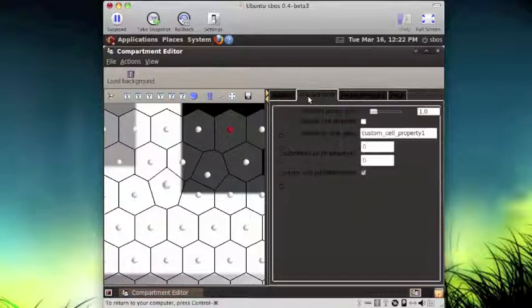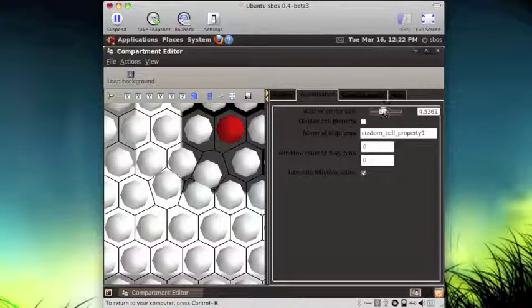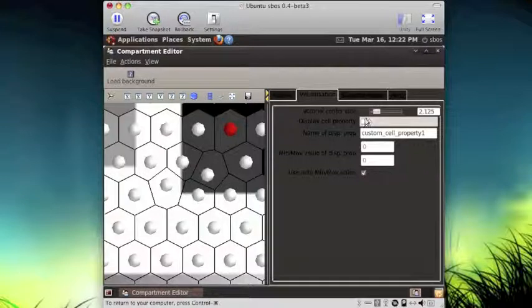And now we can, for example, change the way it looks. If we want to see the centers bigger, we can just increase them up to some values. When they are too big, they form some strange properties. Then we can say that we want to see the value of the properties as a color map of this mesh. So this is what I'm doing.